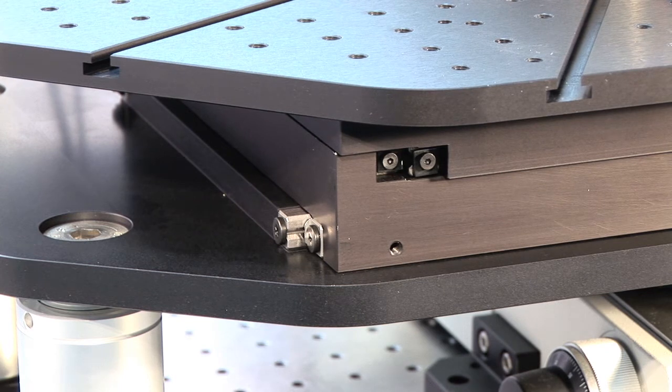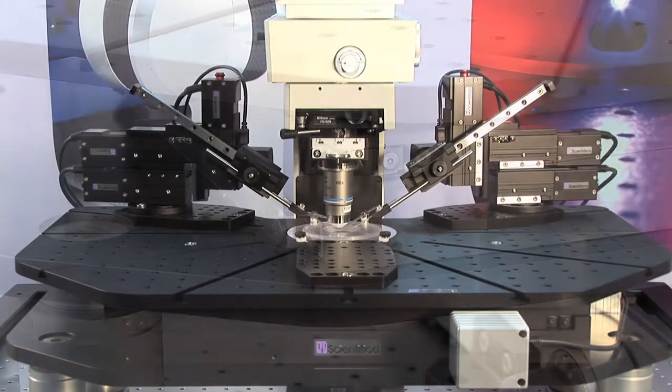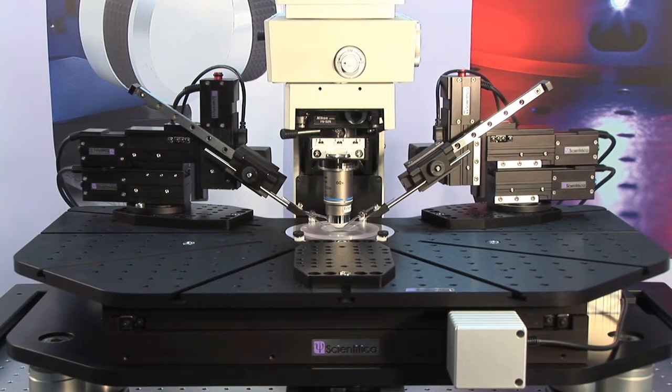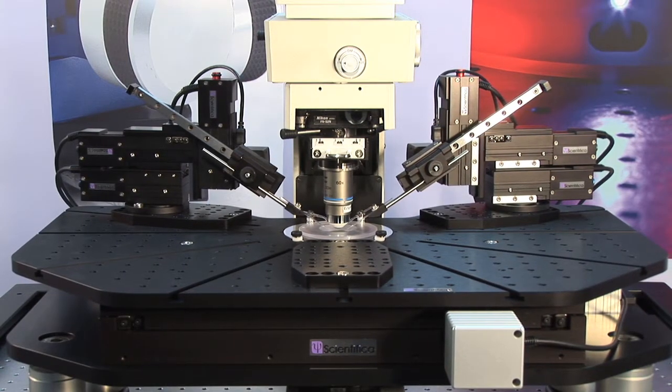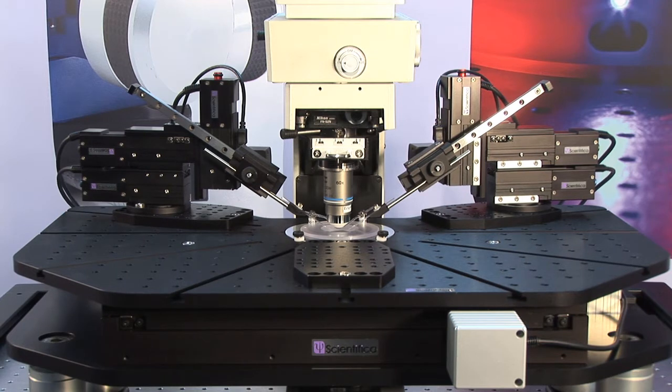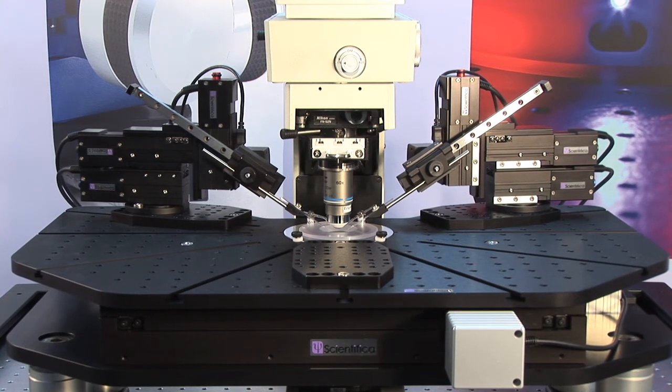The MMTP has 25mm of travel in X and Y with 20nm resolution, allowing a large range of movement across your sample. The fine resolution also enables perfect sample alignment.